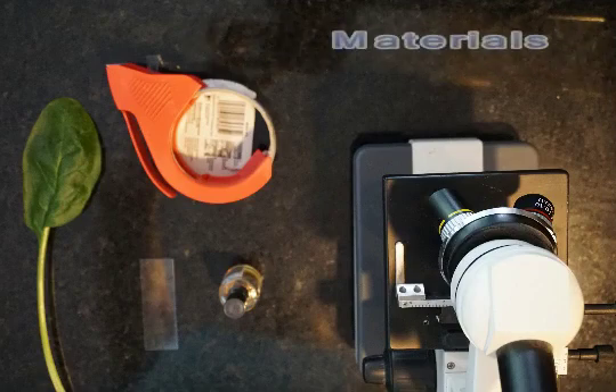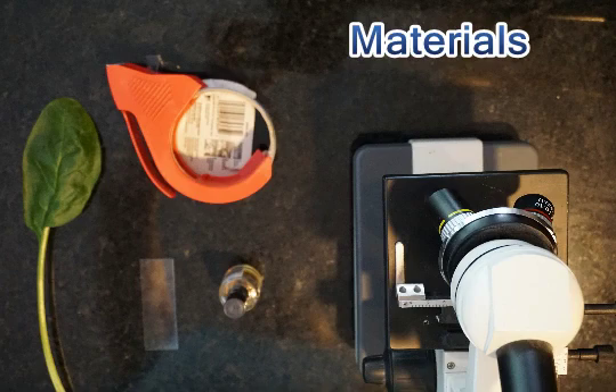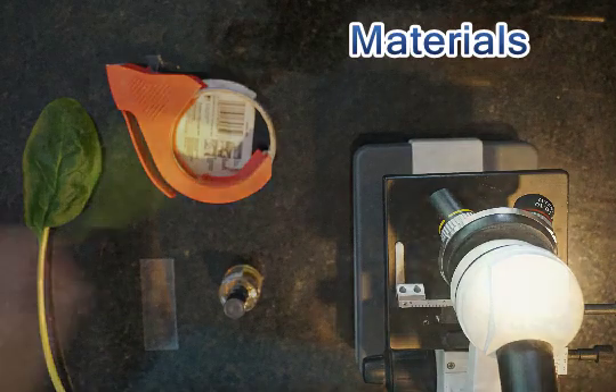For today's lab your materials are clear packing tape, clear nail polish, a blank microscope slide, a leaf — I used spinach since I had some in the fridge — and a microscope.